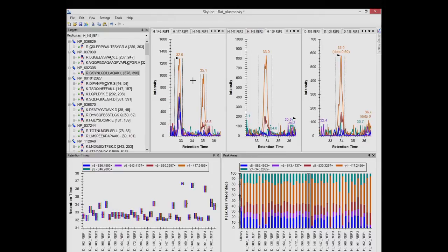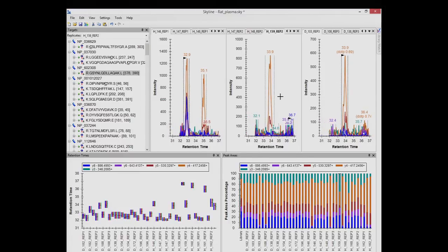And that's sort of an interesting quality about this data, is that when you have interferences that don't actually coelute, they can provide a landscape by which you can understand the rest of the data. So now we have this reference point of when we look at these chromatograms, sometimes, or most of the time, we see this other peptide off to the right. So now if we look at these ones where we have no peak, and Skyline has actually in some cases chosen this peak off to the right, what can we know? The main peak is off to the left. We didn't measure it, right?